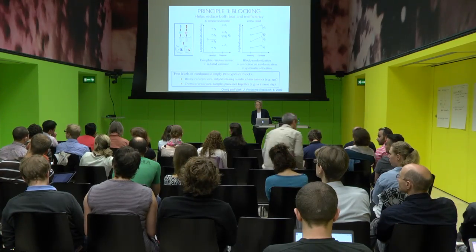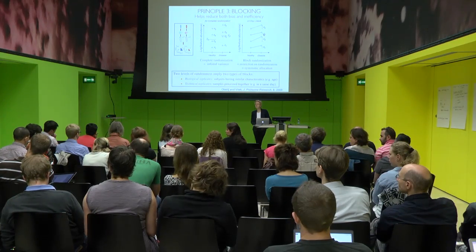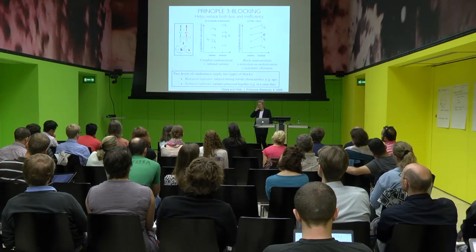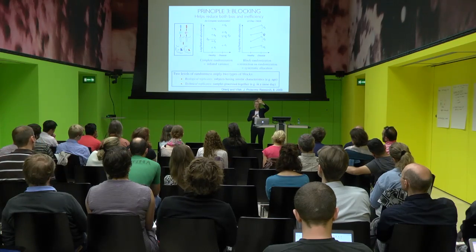Regarding randomization, when you have groups within groups, let's say fractions within the disease and the healthy population, do you have a particular randomization strategy for that? That doesn't matter as much because, well, you have different fractions. You would not be comparing this fraction to this fraction, right? You will take this fraction, compare across the groups, right? And this fraction across the group.